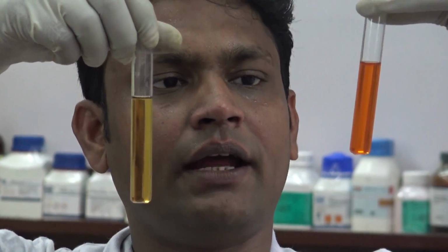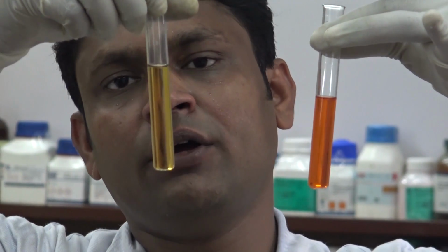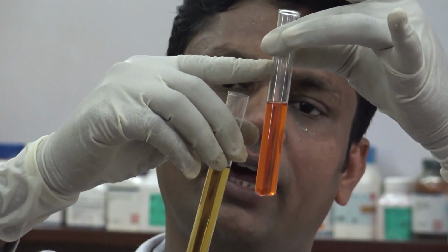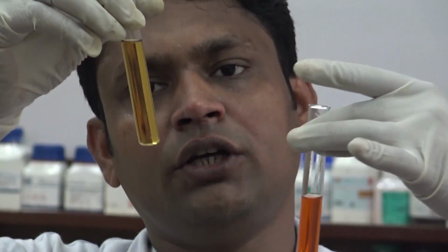Here in my left hand it is the final color of the aluminium solution, and in the right hand is the color with the distilled water without aluminium ion. The final color of the solution is red in case of aluminium, but in case of blank test without any aluminium ion, the color is yellow. Hence, red color of the sample solution confirms the presence of the aluminium.